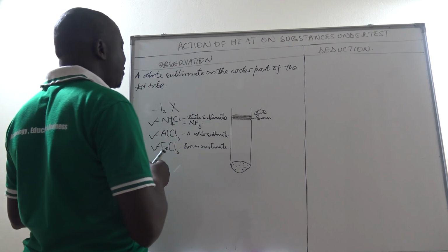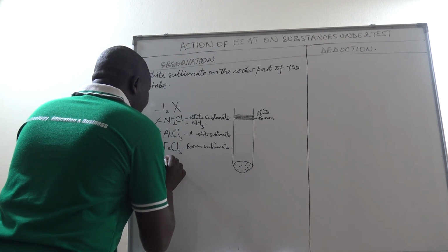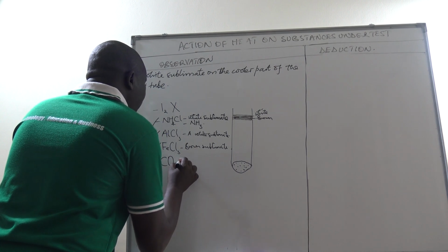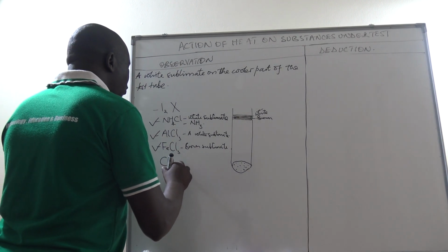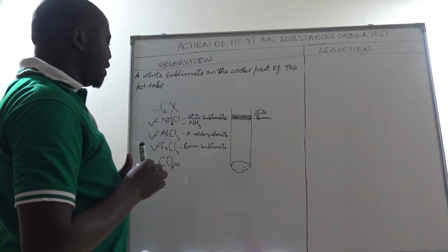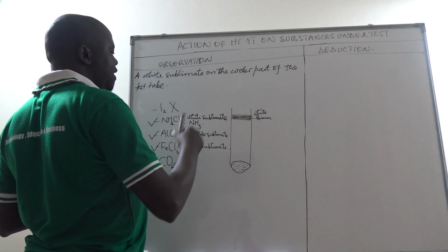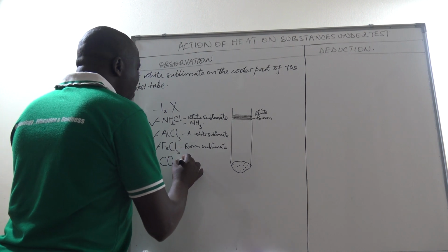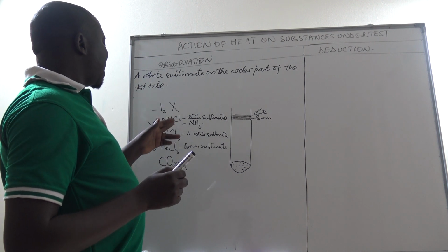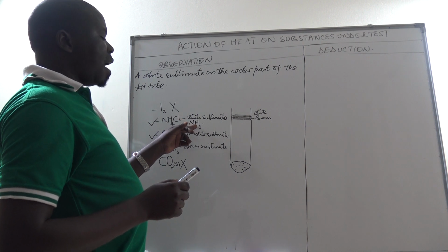Remember that at this level we also have other substances that can undergo sublimation. That is, in this case, solid carbon dioxide. Carbon dioxide which has been super cooled and has turned straight from a gas to a solid in the process of sublimation. So when you heat it, it changes directly into a gas, but we don't deal with it in this case in qualitative analysis. So with sublimates, we expect to get a white sublimate of ammonium chloride together with the ammonia gas.